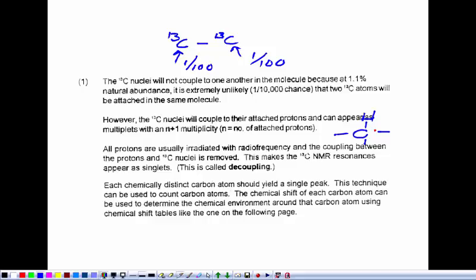After that, you can't have like 5 hydrogens attached to a carbon. Well, you can, but that kind of violates a rule, and the work that won the Nobel Prize only made CH5+. So in a normal molecule, you're not going to have anything more than 3 hydrogens attached to a carbon. So you're going to have quartets, triplets, doublets, and singlets. And so that's an issue, and I'll show you in a minute that it actually can be used to figure out the pieces.